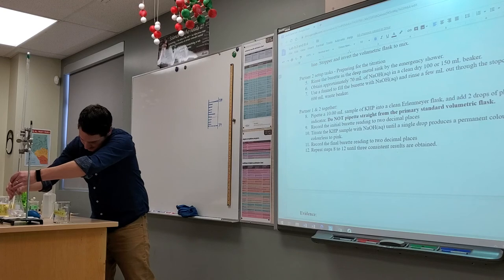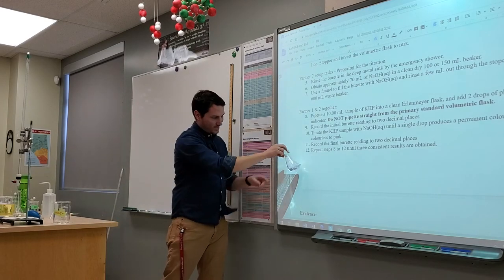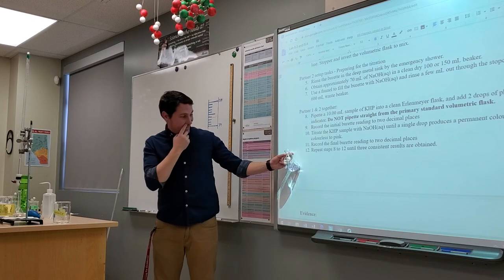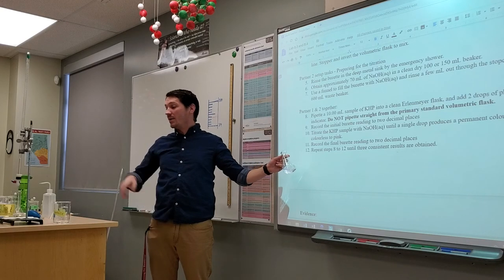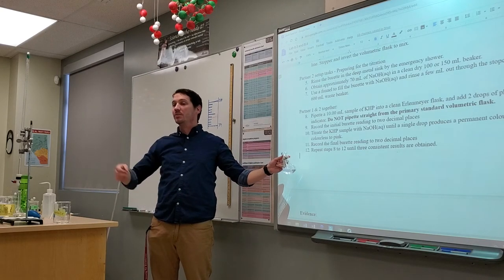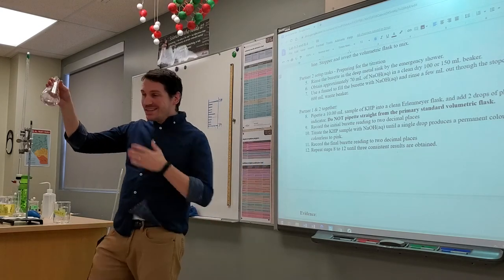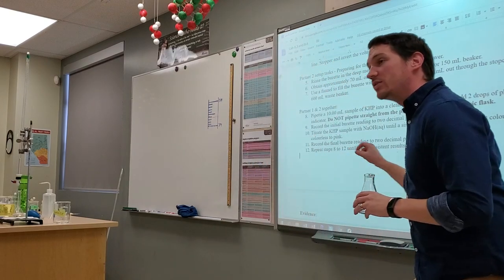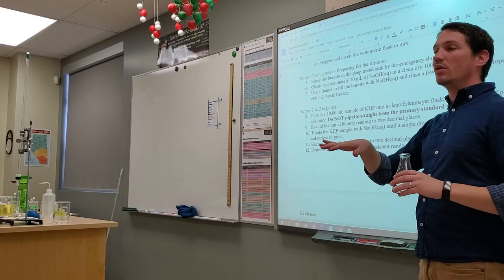One more drop. I feel like I'm gonna mess it up. Yeah. That's too pink. I went too far. I went a drop and a half too far. I missed it. So I probably screwed up by about 0.3 milliliters because I was trying to go too fast. So please don't try and save time by going too fast. When you go too fast, you screw up and you have to do it all over again.